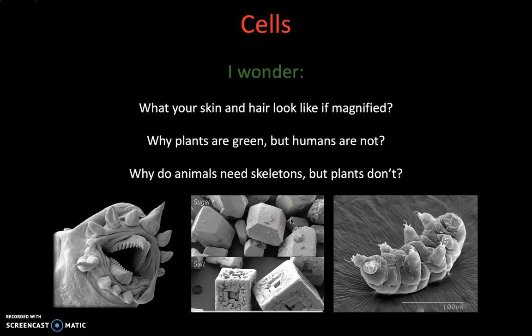In this episode, we're going to cover a little bit of the basics of using a microscope and what a microscope is. In this topic of cells, you'll be using the microscope fairly often, having a look at structures and objects that are much smaller on the scale of what your eyes can actually see. So a lot of the time we'll be viewing cells under the microscope.